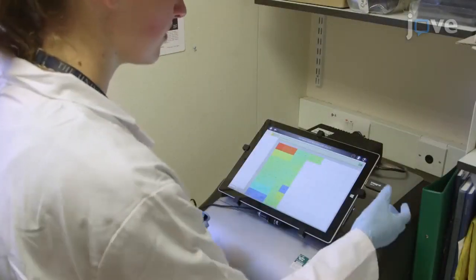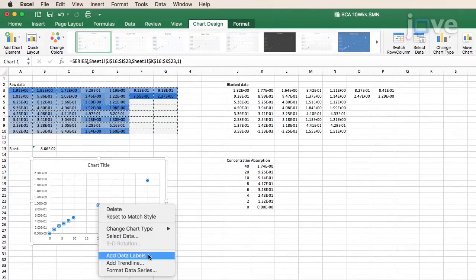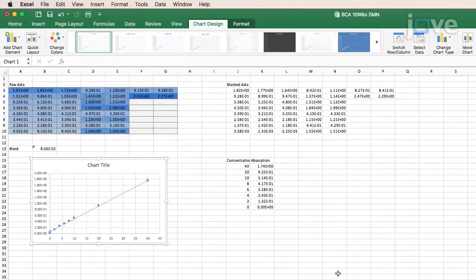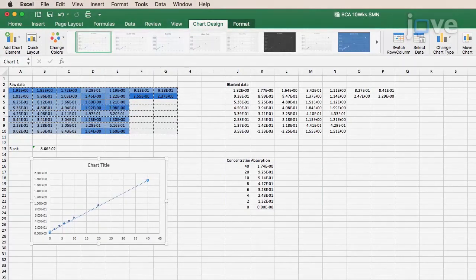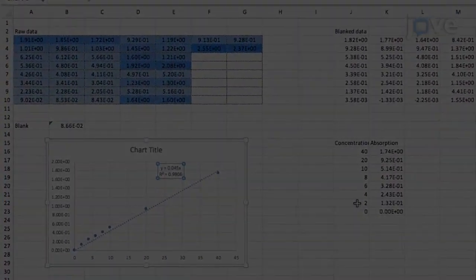Export the plate reader measurements and calculate the protein concentration by comparing the average absorbance values of each sample to a standard curve obtained using the protein standard.